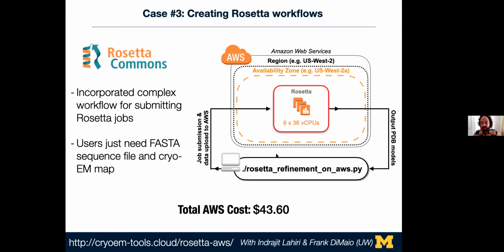For people who haven't used Rosetta, Rosetta has a lot of files that have to be edited and customized. That just takes some practice and getting used to. By wrapping it into this software, we ran it on Amazon, which is nice. And we also had a value added bit, in that we put some expertise that we got from running Rosetta into this, so it's easier for you to use. So I think it showed that you could add value by writing software around complicated commands that would make it easier to run and get you the results back.